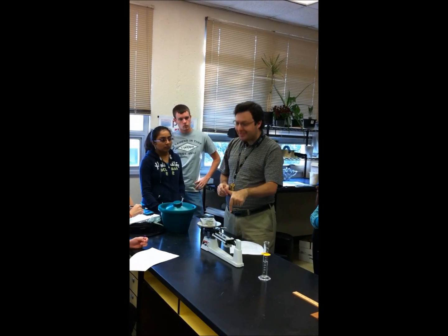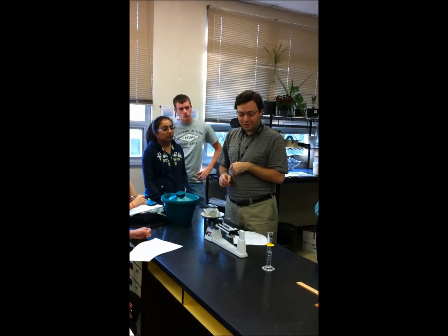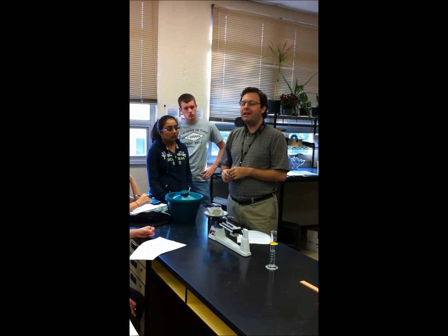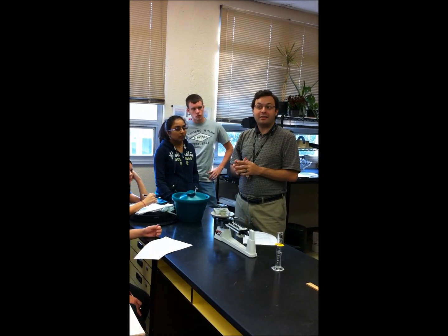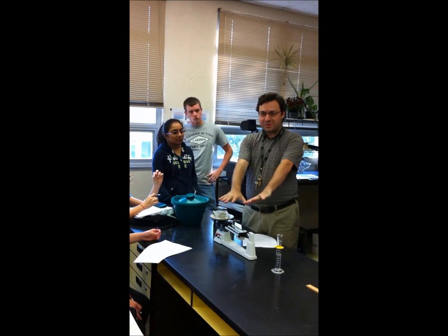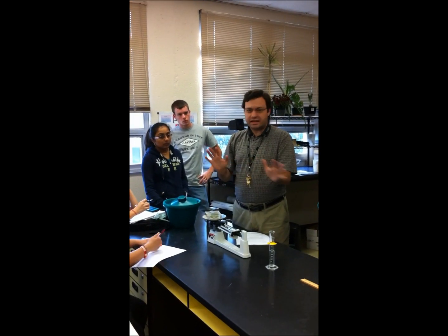Please, no one touch this thing, because I had a near riot a couple semesters ago because someone thought, that just is a little bit off, so I'll change it and make it right. And it made 3/4 of the class miss the question, and I thought they were going to lynch the person, so it was not good. So whatever the triple beam balance is, just leave it and read it. That's all you have to do.